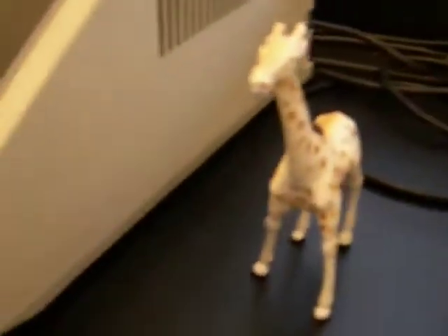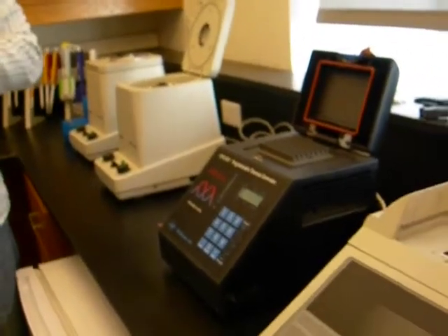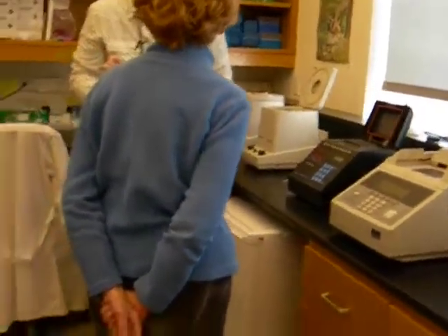These are PCR machines and what they do is go through a series of temperature changes. When you have your original DNA you've got to break those bonds to split it in half, and that's a high temperature. So you go through a high temperature, it breaks all the bonds, it goes a little lower and the primers attach. Then there's another temperature where it actually replicates and that zipper goes along and makes another copy of that gene.